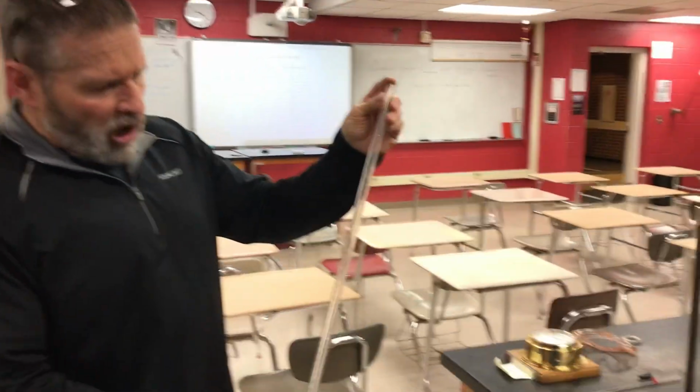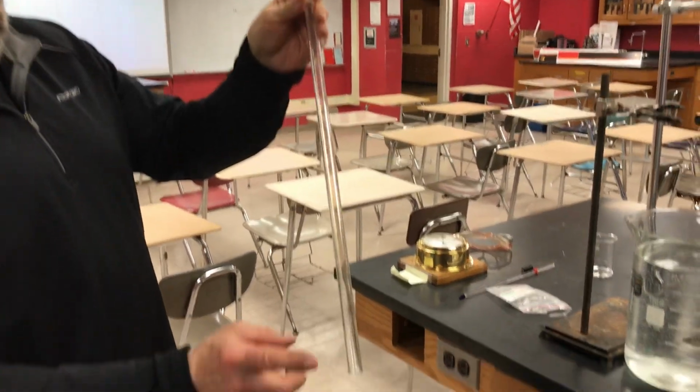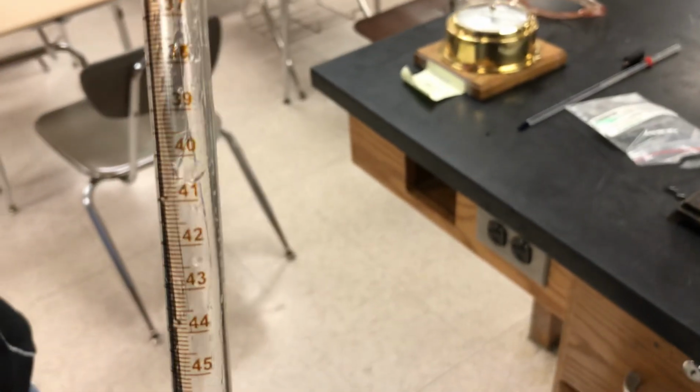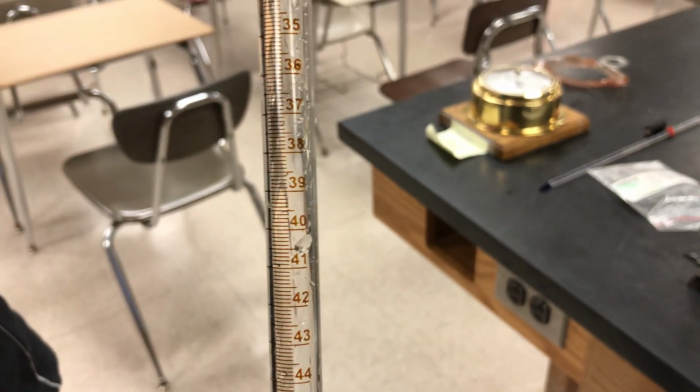We're using something called a Eudiometer, which is really simply a glass tube that's open at one end. It's closed at the other end. But what makes it special is it's graduated, and it's very accurately marked, so you can get an accurate volume measurement of the gas collected.